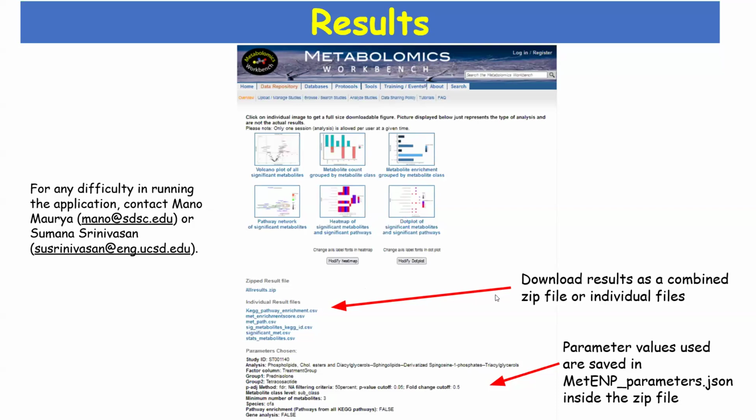These results can be downloaded as individual files, or they are also available as a zip file, which also stores the values or the parameters that were selected during the analysis. So that is important for provenance purposes.